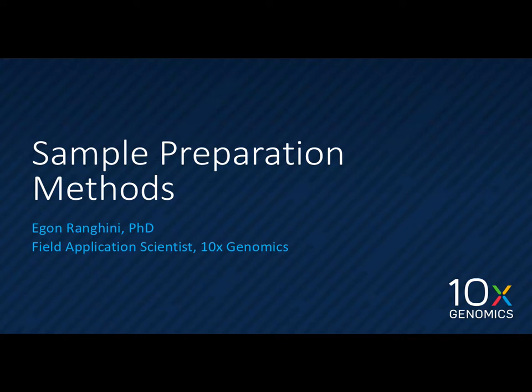Okay. Any questions? Sure. You have talked about a lot of cell preparation. Are those designed for single-cell sequencing or for general application? Both. You can use some of our stuff for single-cell sequencing. Basically with our columns, you're going to have a single-cell population, a bunch of single cells. But I didn't see any data from you to show your system provides excellent quality single-cell sequencing. That's what we are looking for. Right. That's what the office hours is for after this, so just stop by and we can go over that with you.